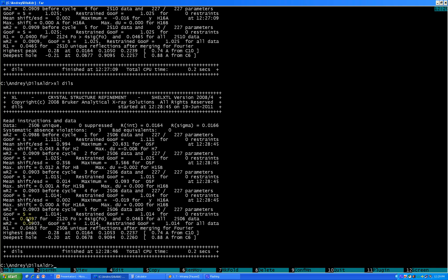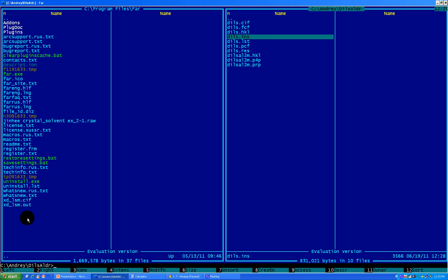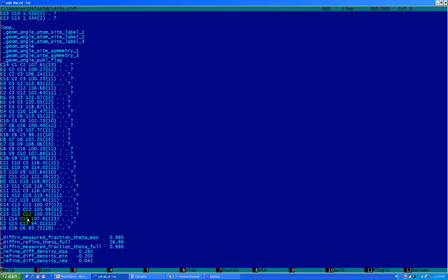What you need to check: let's do Ctrl-O, go to the CIF file, go down, and make sure that your completeness is still 99%. You don't want to go below 97%, because if you go below 97%, you'll have bad comments from your reviewers and you'll have errors in your checkCIF.